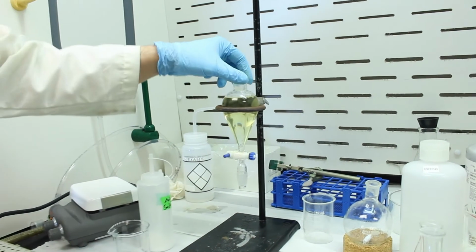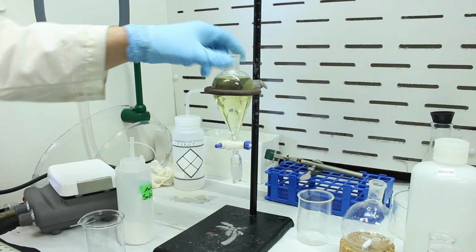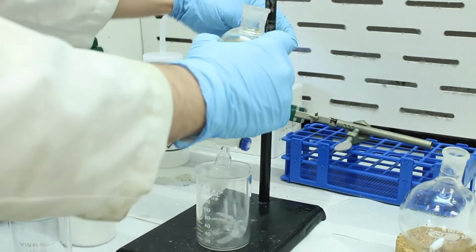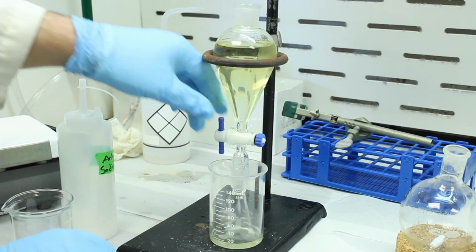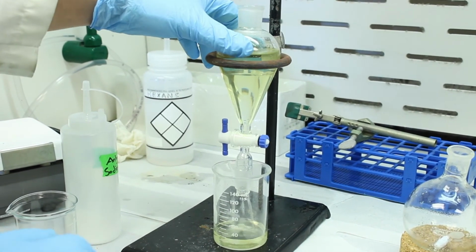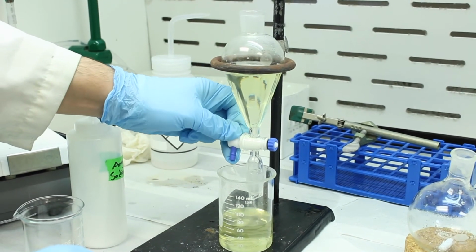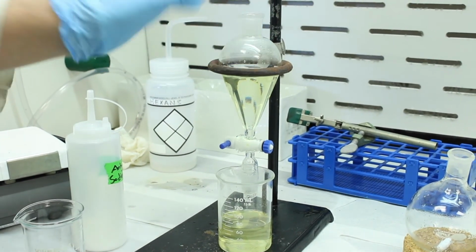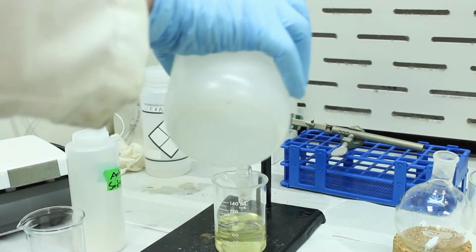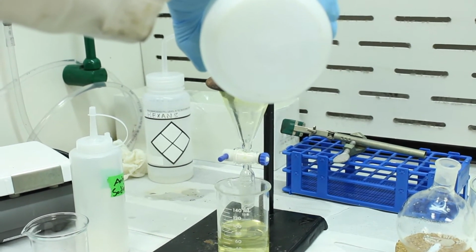Okay, so lower layer is the water, upper layer is the ether. We're going to remove the lower layer. So the lower layer contains the excess hydrochloric acid and the magnesium salts. Okay, and then to clean the ether layer, we're going to add some brine. So this will wash out residual HCl, as well as pull out any water that's stuck in the ether layer.